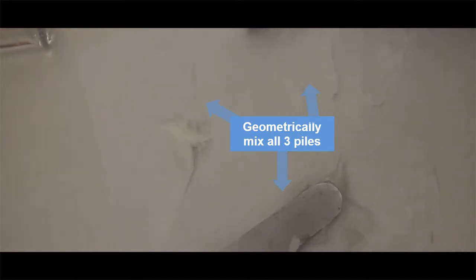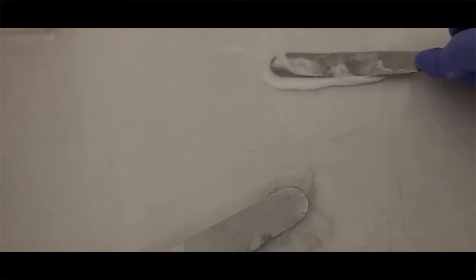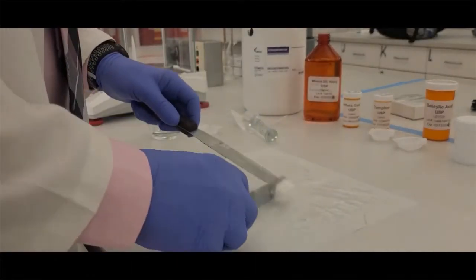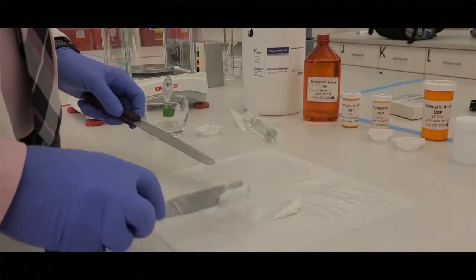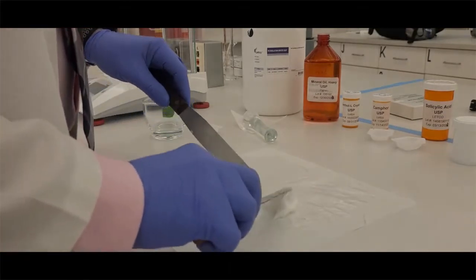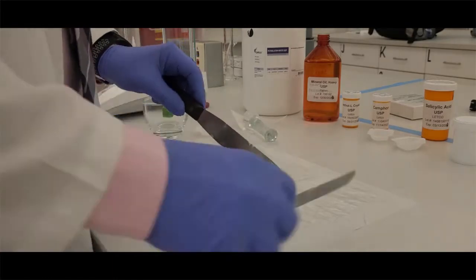My goal here is to geometrically mix all three of these piles into one uniform mixture. So you're going to see me do that here. I'm going to be taking those two piles of the salicylic acid and the eutectic and mixing those together. And once I get that, I'm going to start to incorporate a little bit of that ointment, about the same exact size as the mass that I have originally.